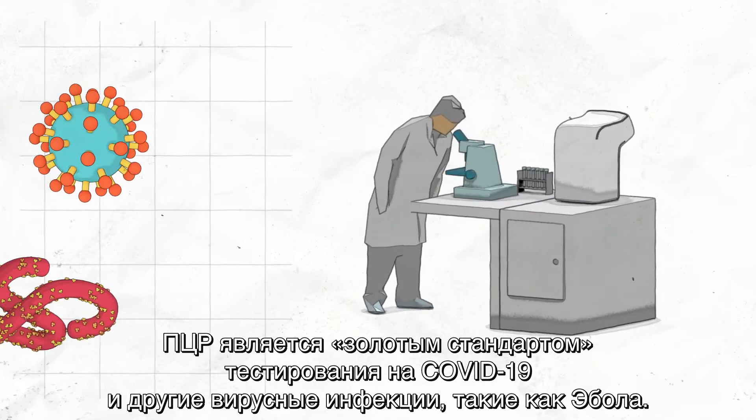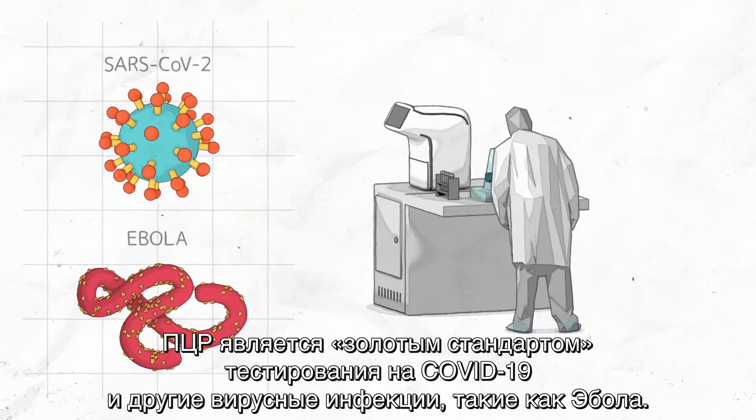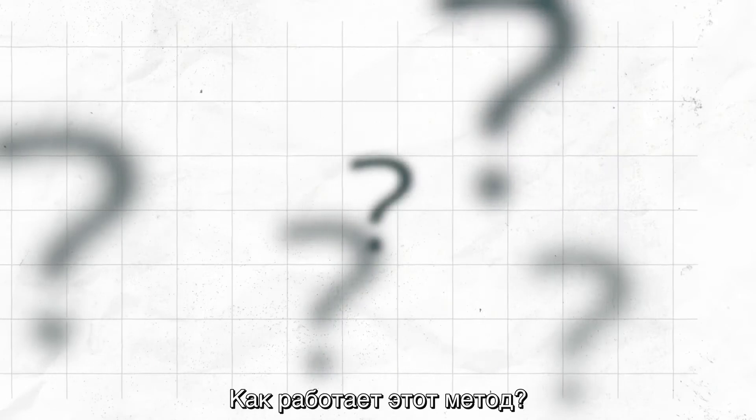PCR is the gold standard in testing for COVID-19 and other viral diseases like Ebola. How does it work?